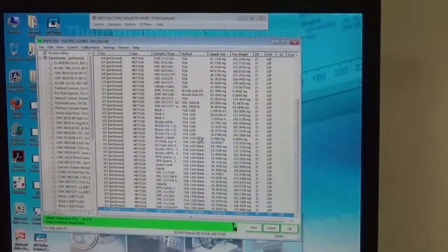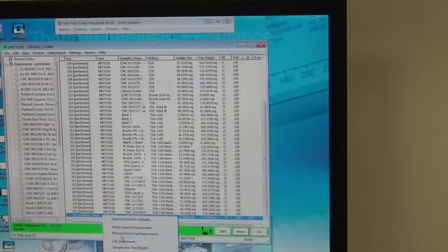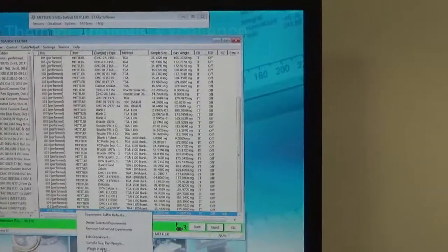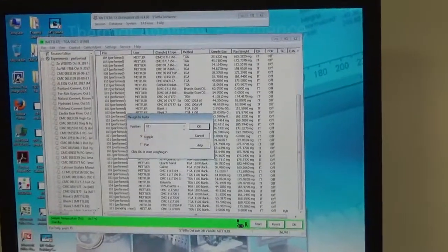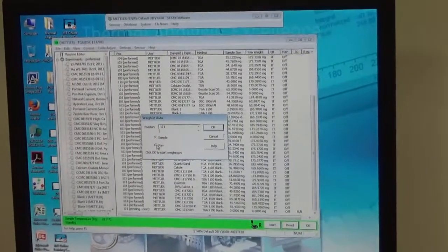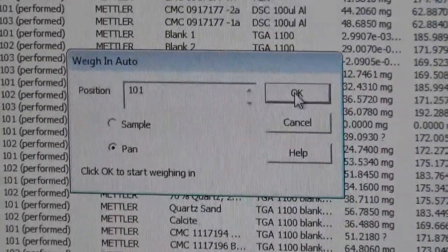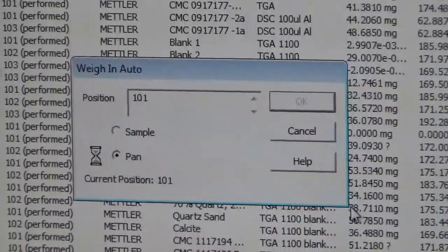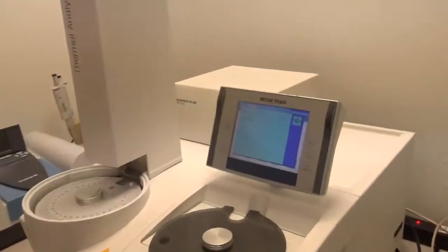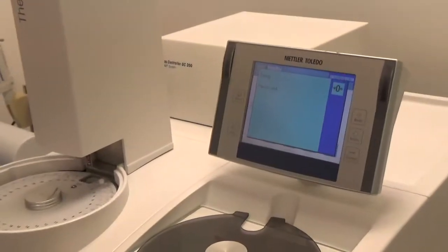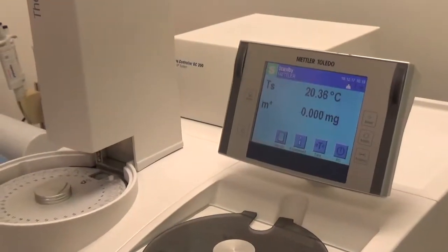We want to reset it and add the weight under 'weight in auto mode.' First we are weighing the pan — the empty crucible. We say okay, and once we say okay, the three rods of the robot will pick up the crucible. The furnace opens up.